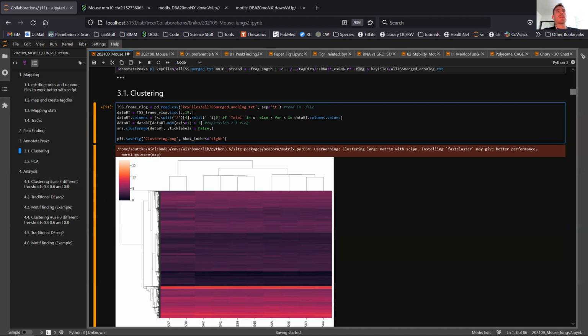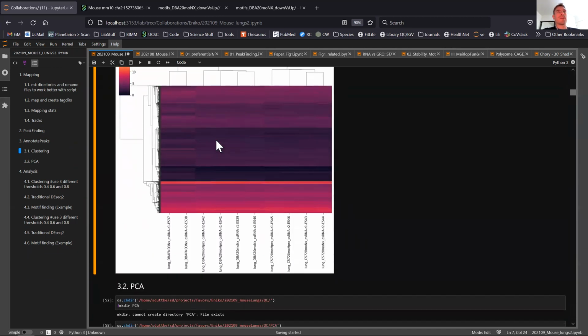And I just split this one here to make this look nicer. And the data start in line 19. So long story short, the columns between 0 and 18 are just garbage, which you can't really plot, like which gene it is, the coordinates, and so forth. So here we just want the raw values and generate a cluster map. And as you can see here, also save it in the QC folder.